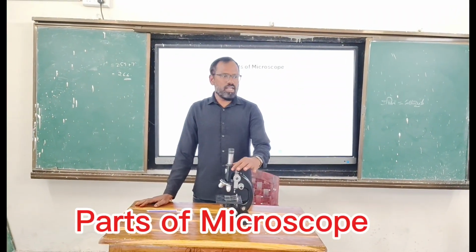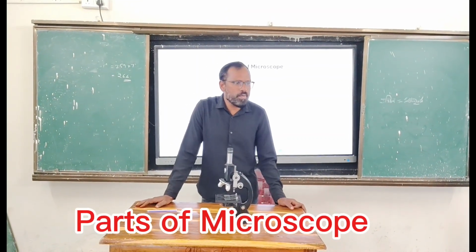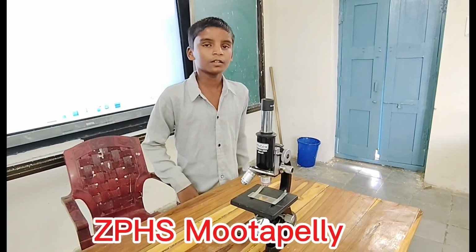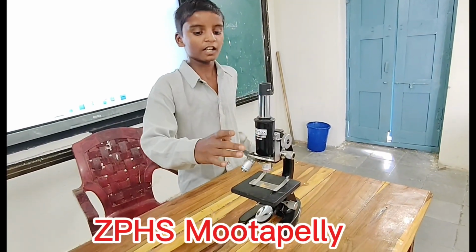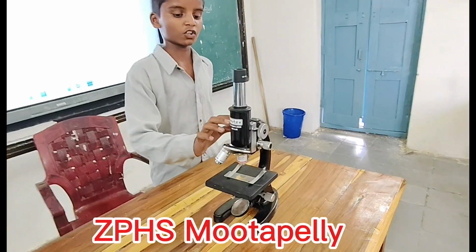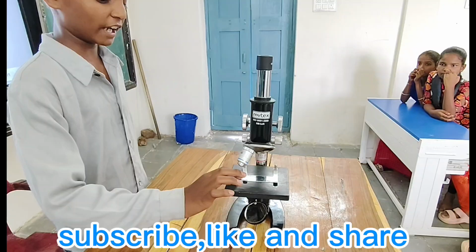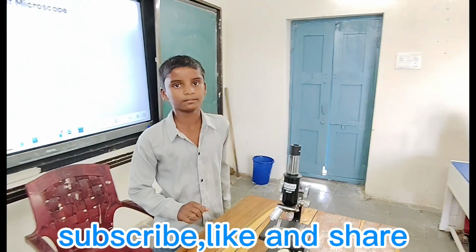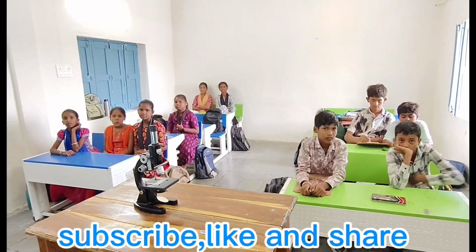Okay. Do you know what this is? Microscope. Do you know the parts of the microscope? Yes. Okay. Now show me the parts of the microscope. Eyepiece, tube, objective lens, coarse adjustment, fine adjustment, stage, clip, slide, condenser, reflector, base. Very good.